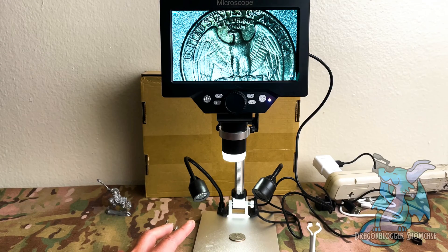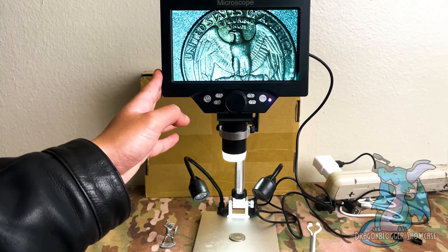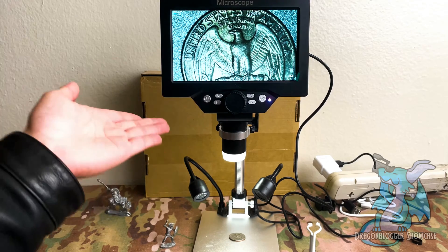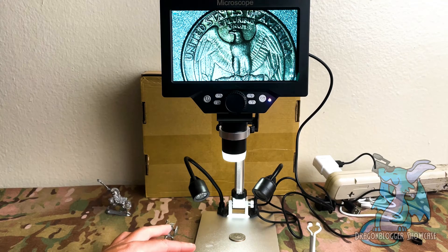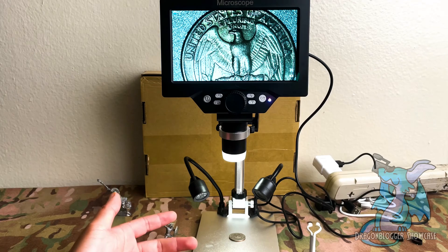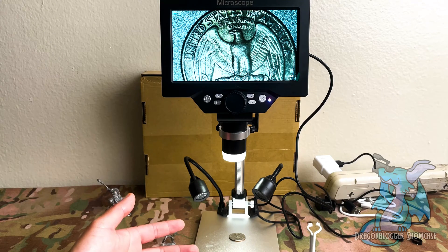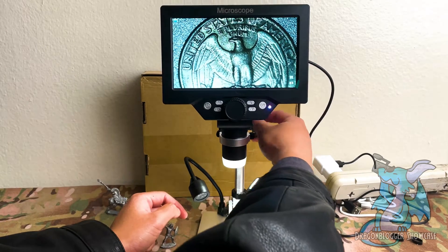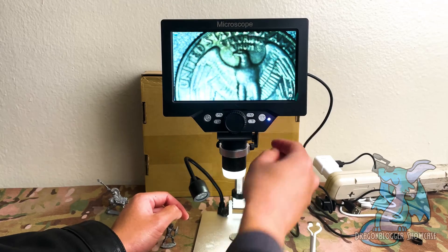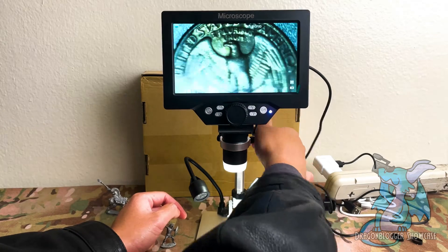A couple of quick features with this one: you're looking at a seven-inch screen, which is a decent size that you can see pretty well with. It does support real-time viewing on PC when connected to one. There is a rechargeable lithium battery so you can take it outdoors, or you can power it directly through USB. You're also able to adjust the height as well as the focus of what you're looking at.